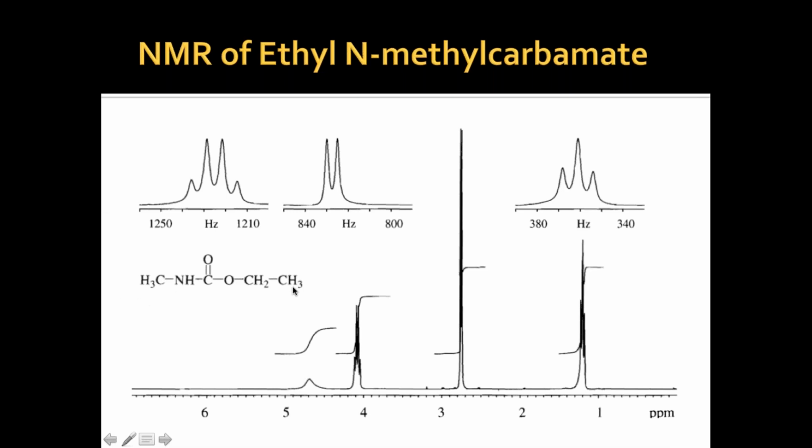See one thing. This NMR is in CDCl3. This NH hydrogen is under hydrogen bonding with the oxygen of the molecule itself.